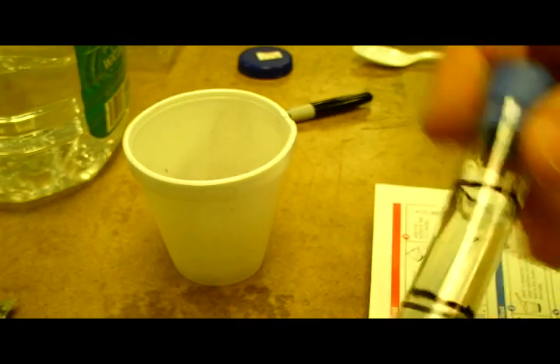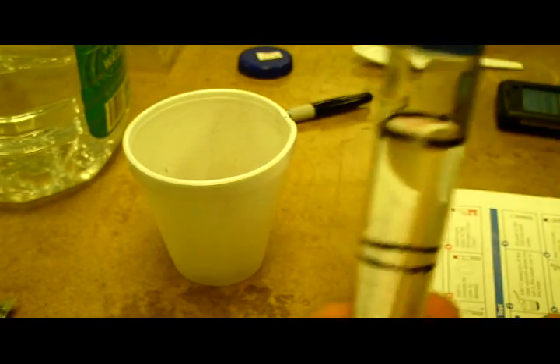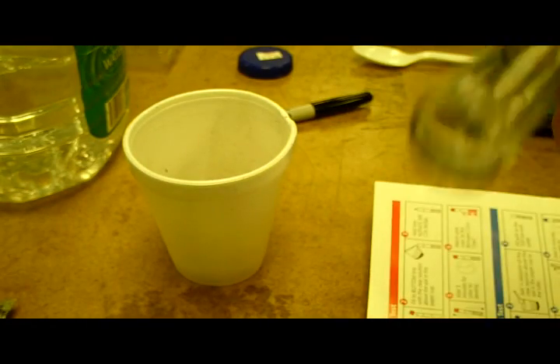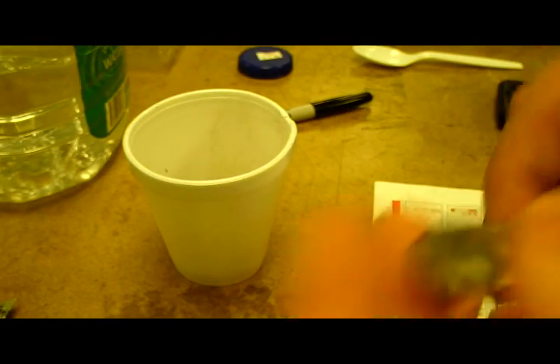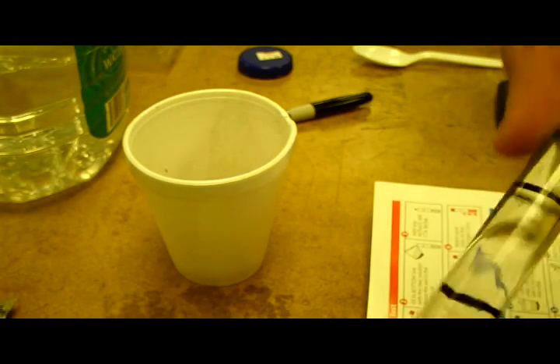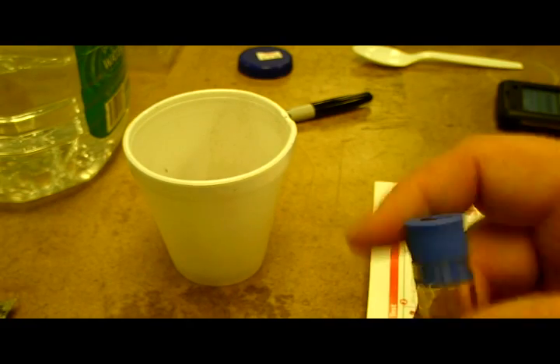For the phosphorus test, I take one quarter teaspoon of the clear solution from the slurry, put it in the tube, fill the rest of the way to the top line with distilled water, add one phosphorus tablet, mix until the tablet disintegrates, and wait five minutes for color.